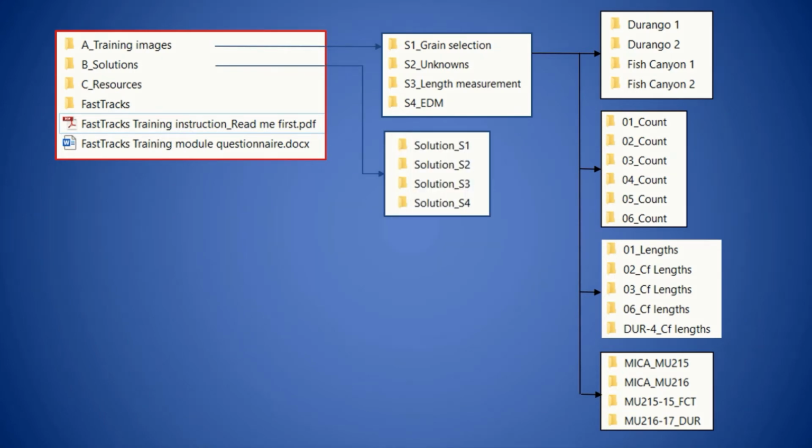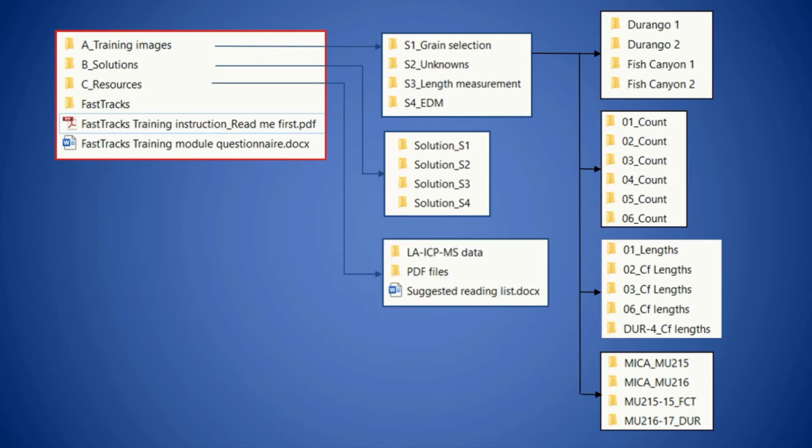Secondly, a folder contains recommended analytical solutions. These files have been examined by at least 2 experienced analysts, and the results were reproduced well with published data where applicable. The last component is a list of recommended reading and online resources covering background knowledge and age calculation, as well as the thermal modeling sectors, for trainees to study at their own pace.